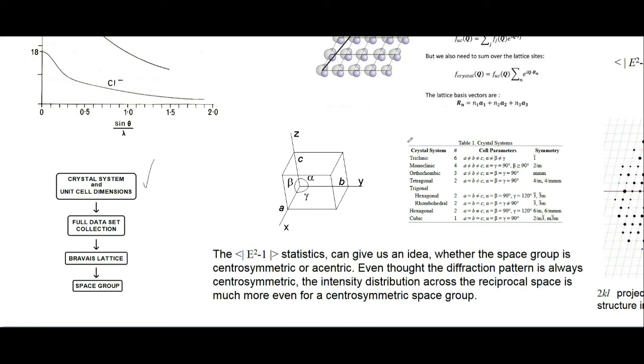and we can get what are called the Laue groups. I don't know if that's how you pronounce it. I've only ever seen it written. And so we get these Laue groups, which tell us different things about the lengths and the angles in our unit cells, and they have these different names for the Laue groups.